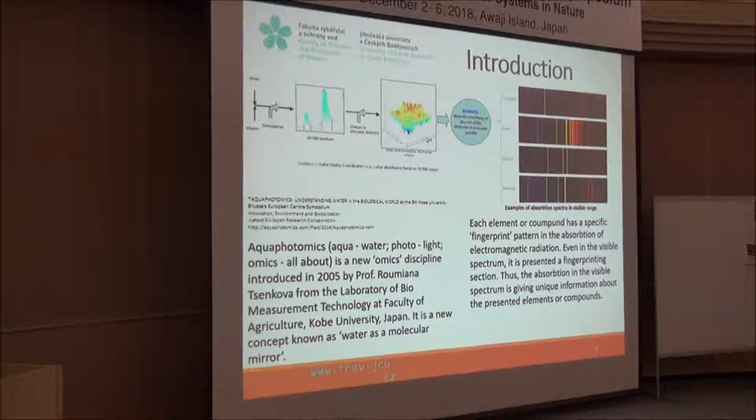I started to do spectrophotometry, and the main goal of this research is to develop an easy-to-use system which can predict the values of basic water parameters from spectral measurements. I decided to work in the visible range because of the price of devices and availability.